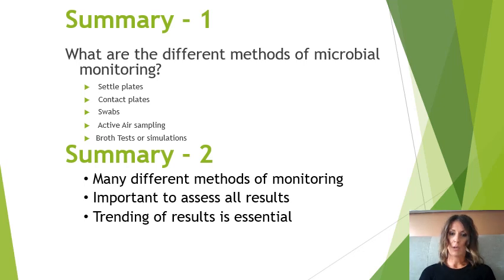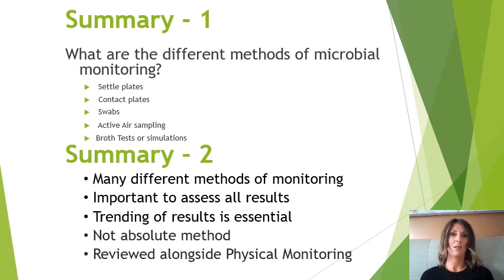It's important that we look at all of these results in a holistic approach, so they all influence each other. They aren't independent of each other. It is providing us an overview of our clean room and our processes of transferring products in and out and consumables. And it's really important that we trend all these results and monitor any changes, variations or anomalies to provide assurance that our clean room is performing at the level that we expect. So that's all I have to say about microbiological monitoring.